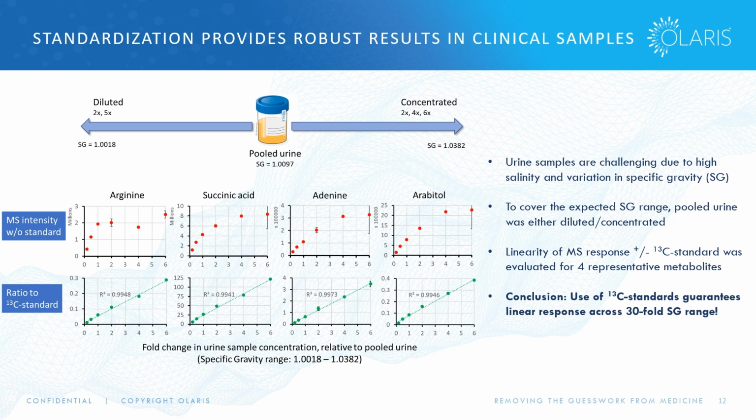And so what we did there is we spiked into each of the samples at the various concentrations the 13C yeast, prepped the samples and analyzed them by our methods.